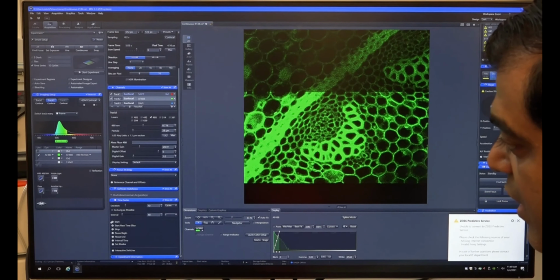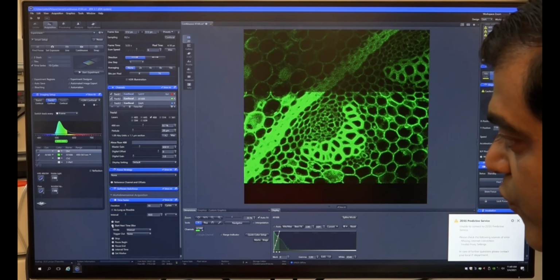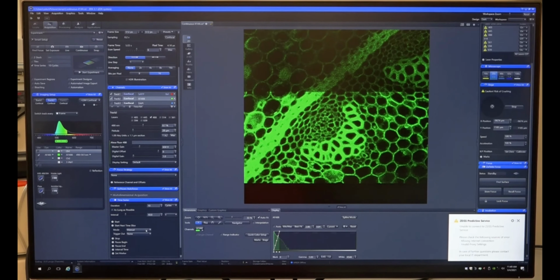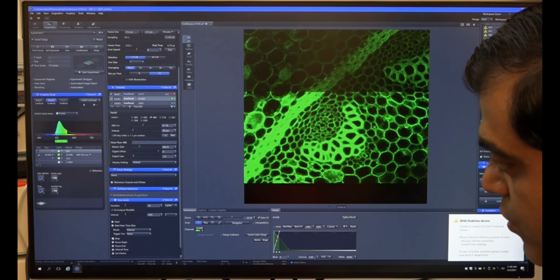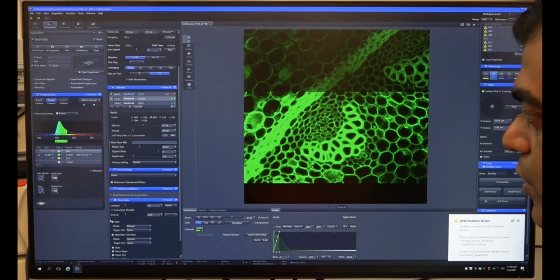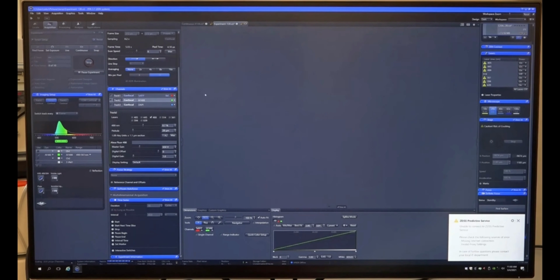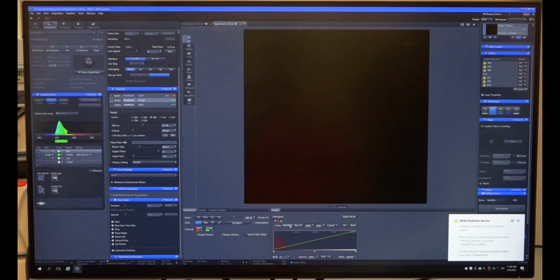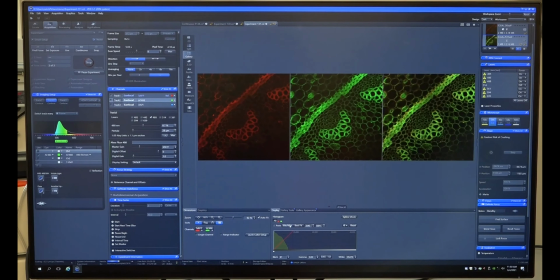Once I have done this, I can start the experiment. But I also have options: before starting I can have a number of slices acquired, and I can do it afterwards also. So pre-acquisition, post-acquisition, how many frames, you can decide all from here. At what time you want to stop, you can also give that. And before you start, if you need a manual command to start, you can set that from here. So options are here, and then you say Start Experiment. In the experiment, nothing is going to change against the time. You can see both the things I have got over a period of time.